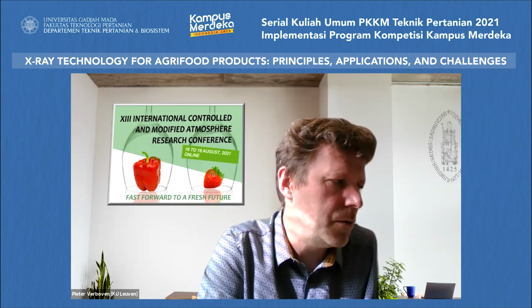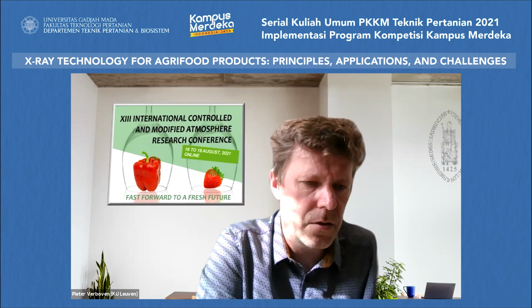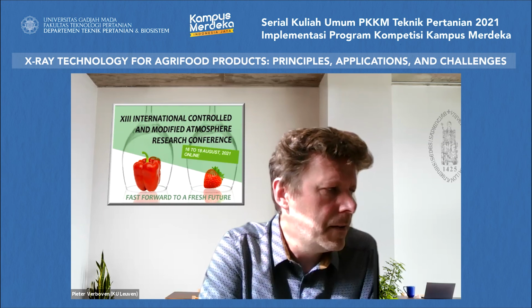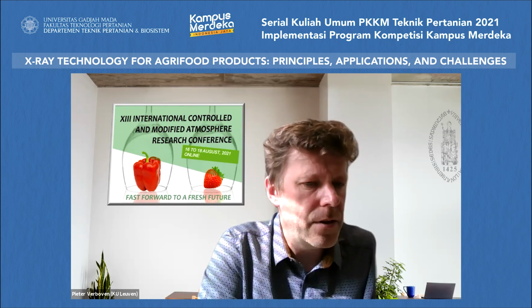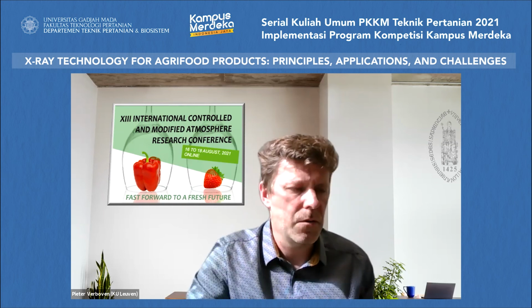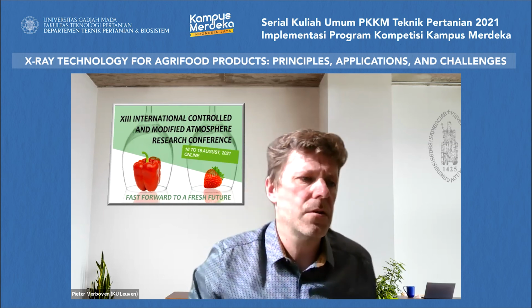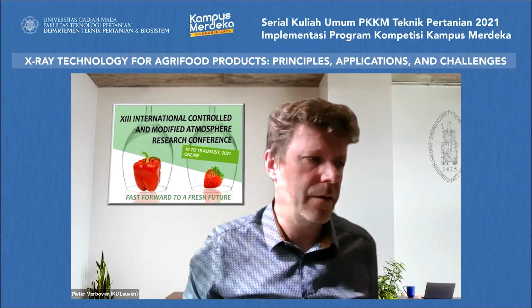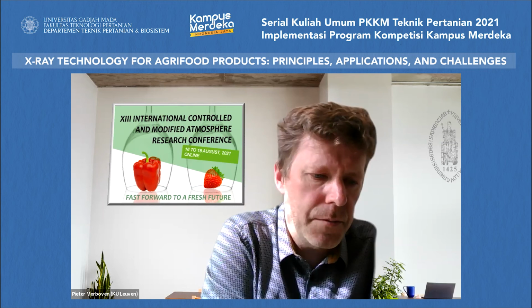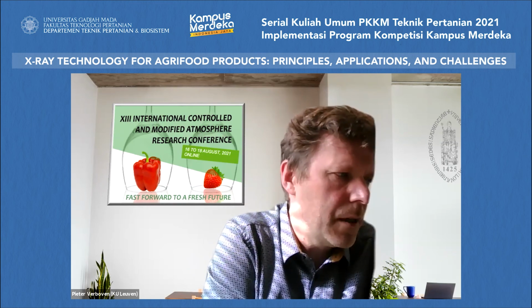We know that when we do high intensity X-ray imaging, like for instance at the synchrotron facility that I showed you in the beginning shortly, you have very high X-ray intensity. It's very similar to a laser, comparing a laser to a normal light source. These X-rays are very, very much more intense. And if you use those, you can do scans with them, but you completely destroy your tissue.